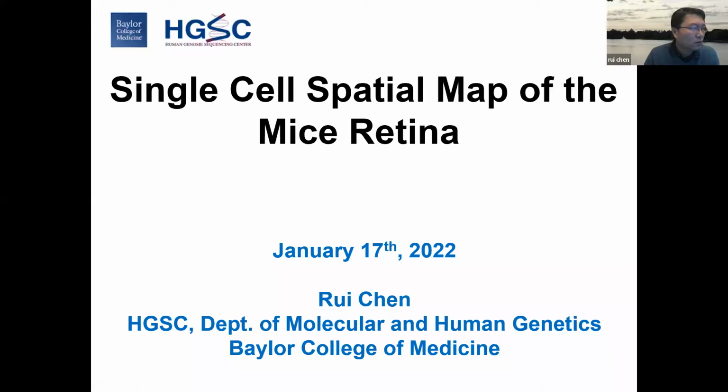So today I would like to share with you our recent effort using the MERFISH technology to construct the spatial single-cell map for the mouse retina. And I will say we have encountered many challenges and learned a lot. So hopefully our experience will be useful for your upcoming projects. Let me share my screen first. Can you see the screen okay?